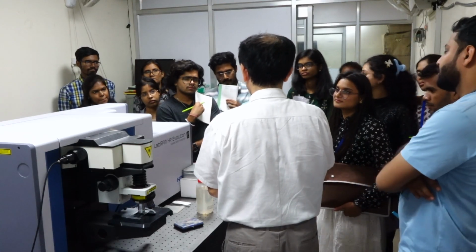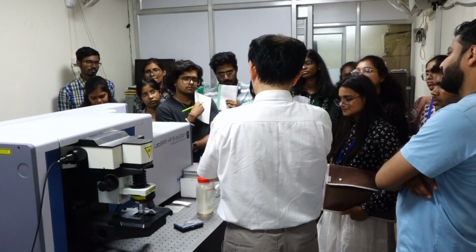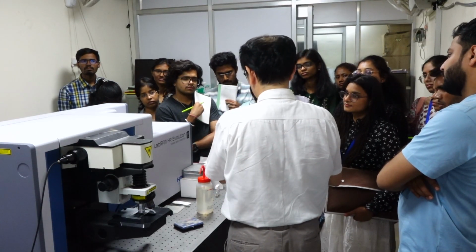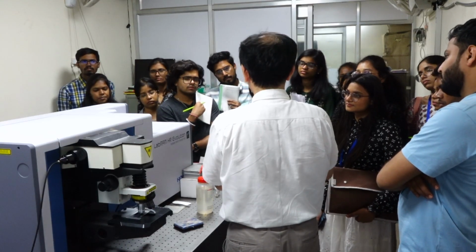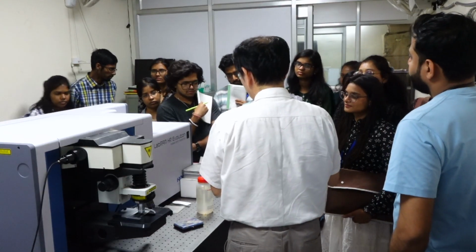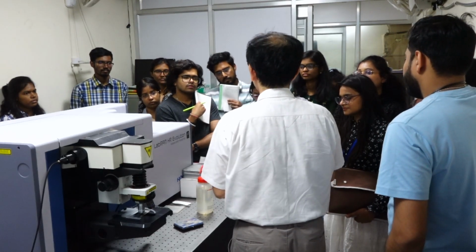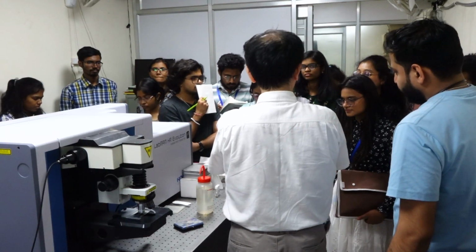Stronger light damages the sample, so it depends. In the case of semiconductors or some hard material, it's possible to focus, and it is safe. When we want to measure skin or some living cells, a strong signal will burn it and it becomes carbon. So it depends on the purpose, and the highest laser power or smallest focal point is limited by the condition of the sample.